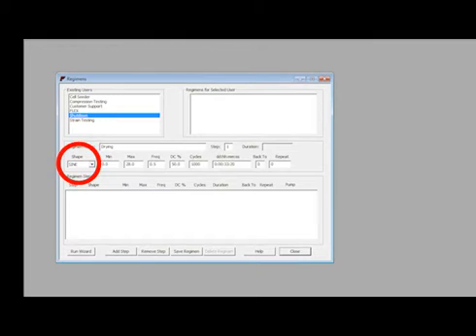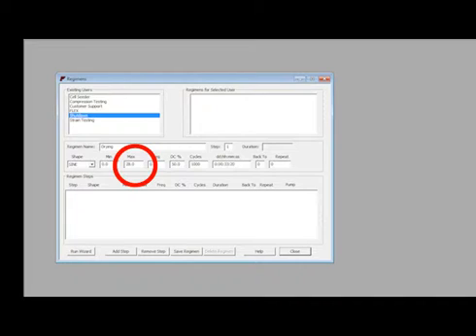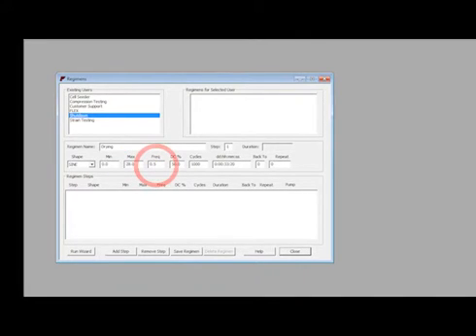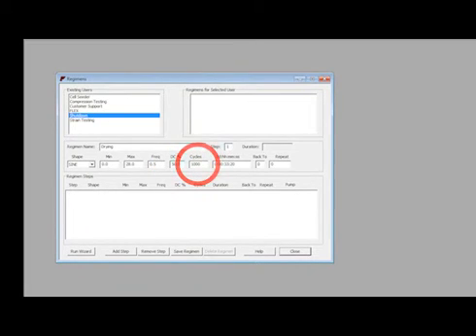Select Sign for the waveform shape. Type in 0 for the minimum value and 28 for the maximum value. Type in 0.5 for the frequency, 50 for the DC percent, and 1000 for the cycle numbers.